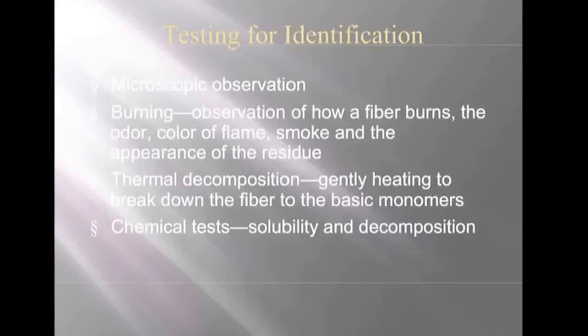Alright, so this section is going to be talking about how we actually test different types of fibers and how we are able to make an identification based on those. So, a couple ways. First is microscopic observation. That's going to go back to all the stuff we learned about in terms of the weave of the fabric and being able to look at it that way.